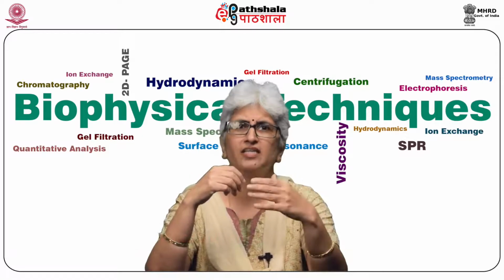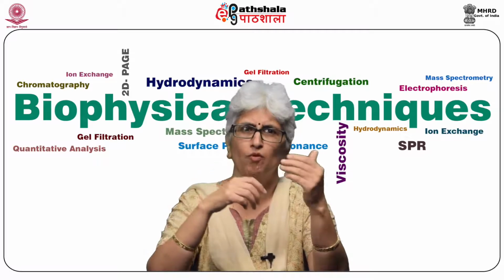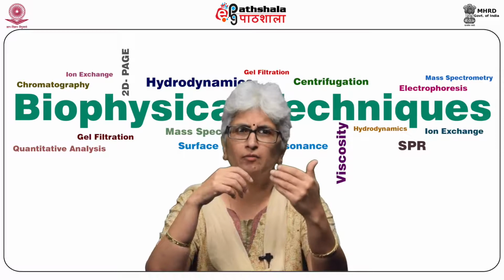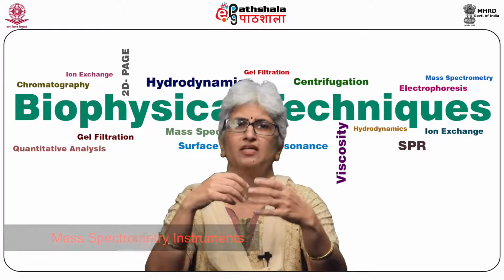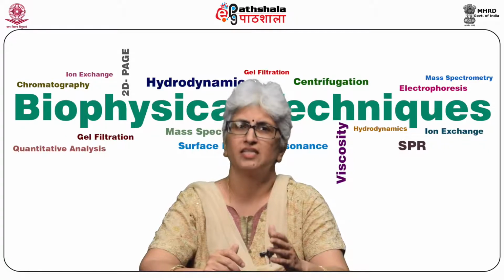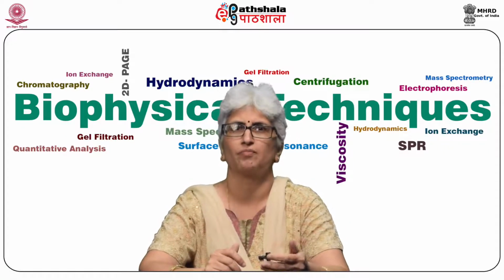This field is still developing and nowadays widely applied to explore fields such as post-translational modification and protein-protein interaction. In recent decades, the development of mass spectrometry instruments and their coupling with the reverse phase affinity chromatography has helped enormously in disease biomarker discovery.